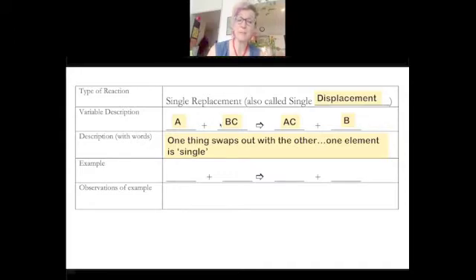The example you're about to see is going to be some aluminum. Aluminum's that single friend. You together with your date would be copper(II) chloride. So here's copper, copper would be you. Don't let that Cl trick you into thinking it's a capital I. That font looks like an I, but it is an L. So CuCl2. And then aluminum swaps in there, steals your date, and makes AlCl3.